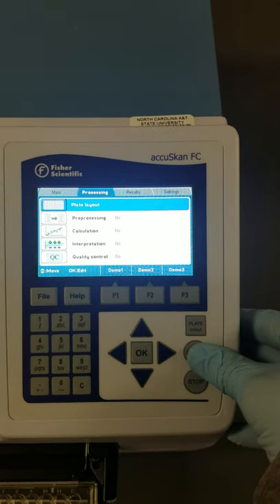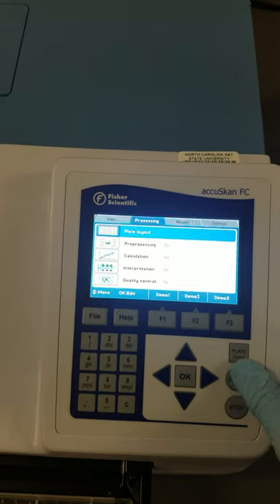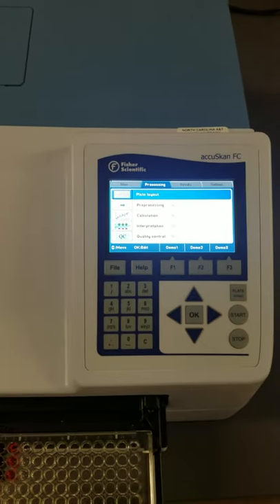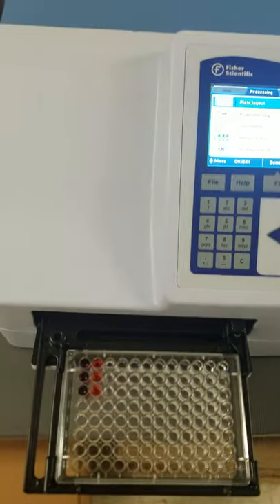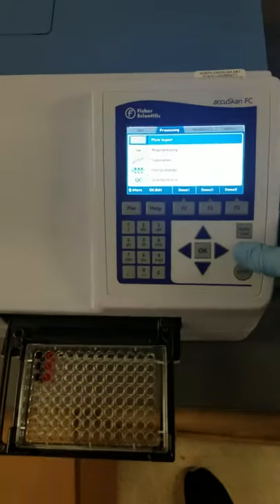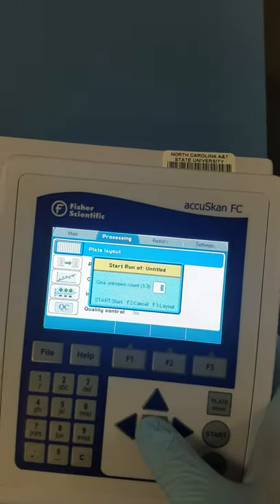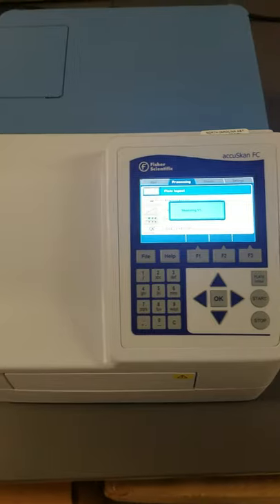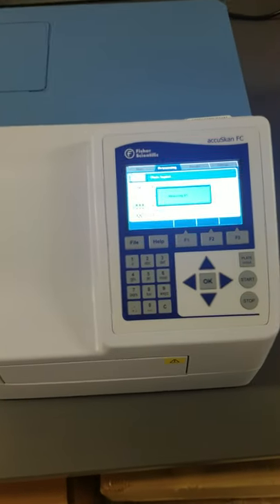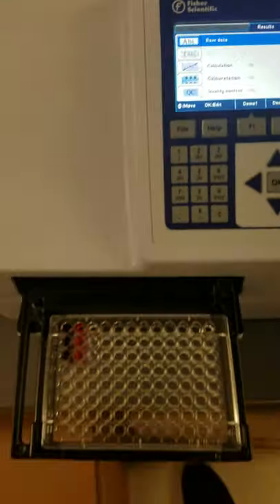So what you want to do is just hit the Start button. You can hit the plate in and out, but as soon as you hit the Start button, it's going to open up the plate loader and then just close it again. So we want to hit the Start button, and just hit OK. And it starts running our plate. It just says measuring — and it's already done.